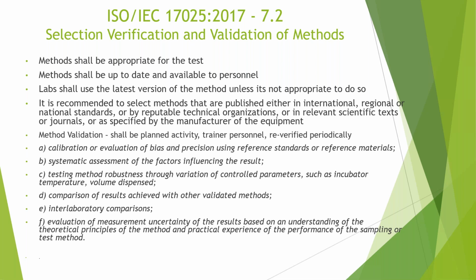Here is what the 17025 standard says in regard to method validation. I'm not going to read them all, but A through F of 7.2.2, I believe, talks about method validation and all these things that need to occur when you're validating your own in-house methods. Some of those things: it needs to be a planned activity, you need to train personnel, and you don't create the method once, but you also have to re-verify it periodically to make sure, again, that it's fit for the use of the test.